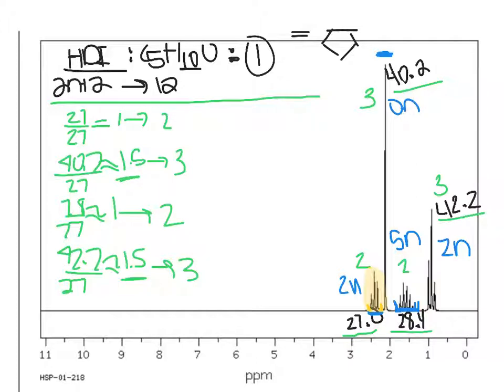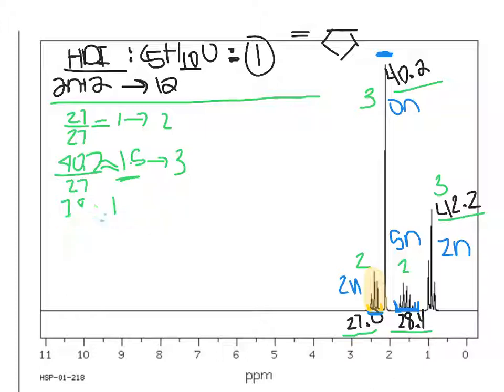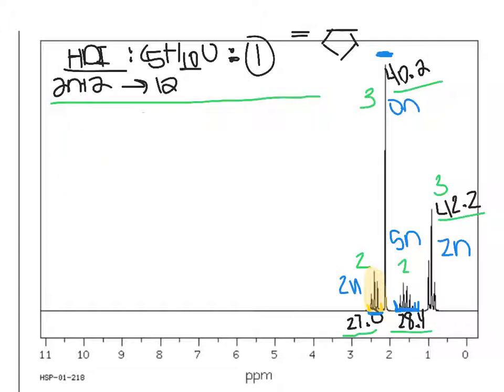Alright, so I'm going to go ahead and make some more room over here so we can start drawing out what we think this molecule is going to look like. So we know we're going to draw a carbonyl group because this was shown by our first set of peaks over here, and this would also account for our oxygen in our formula.